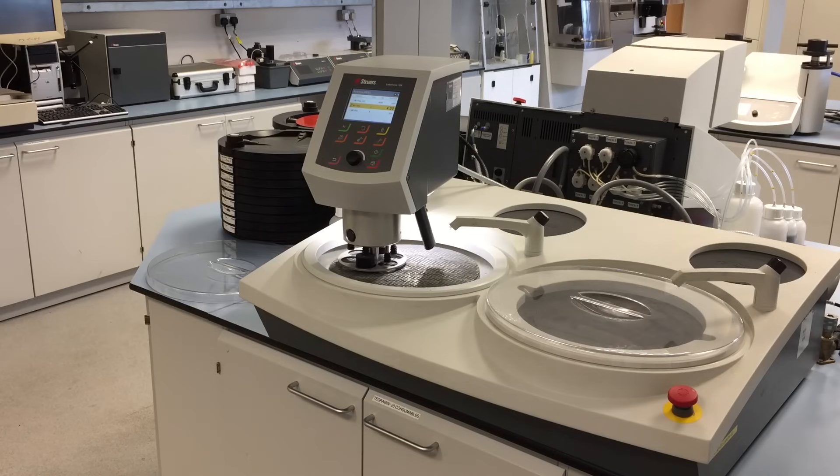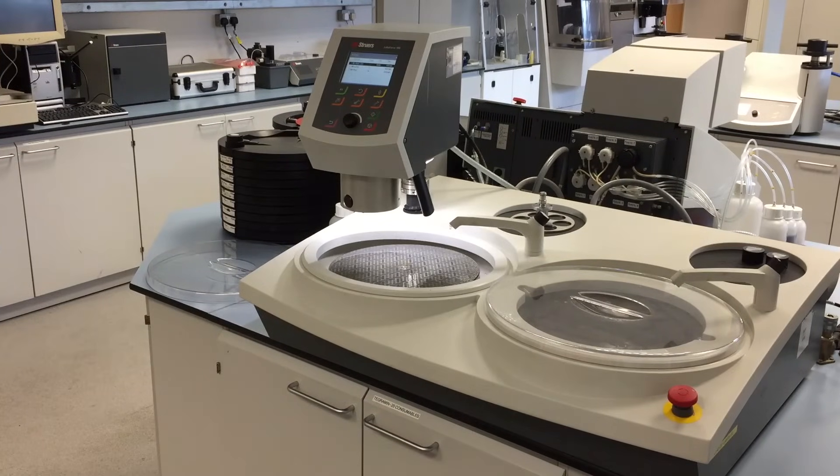Between each step, Matt will use isopropanol to clean the samples and then dry. He will also clean down the machine to prevent contamination. The spin function, with a maximum 500 RPM, makes for easy disc drying and cleaning.